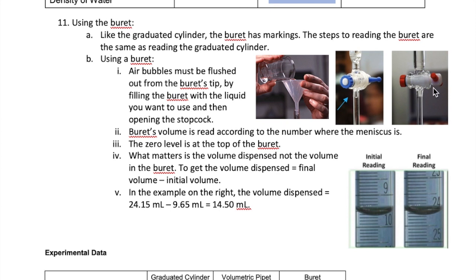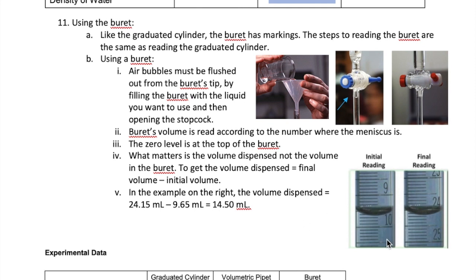Keep in mind that the burette starts with zero at the top and its maximum value at the bottom — so it's flipped compared to the graduated cylinder. To read the burette, simply find the meniscus and read its volume. For example, here the initial reading is 9.65 milliliters. What you care about is how much liquid is dispensed from the burette, not how much remains. In your experiment, you want to dispense about 12 milliliters into the small beaker. So if you start around 9.6, you might want to stop around 21 or 22 milliliters. In this example, the final reading is 24.15 milliliters, giving a dispensed volume of 14.50 milliliters.